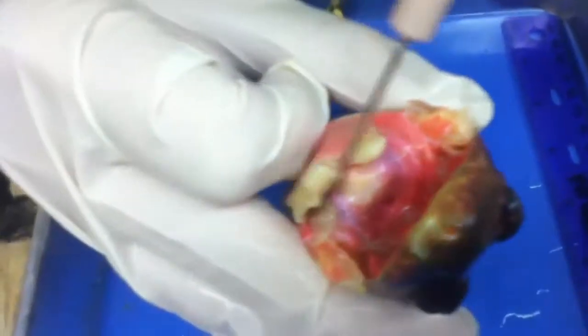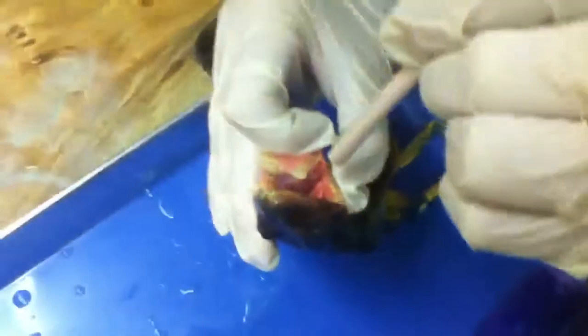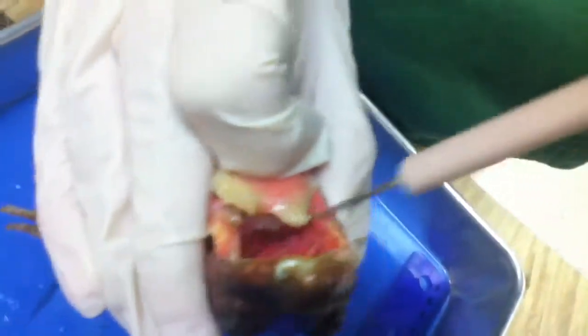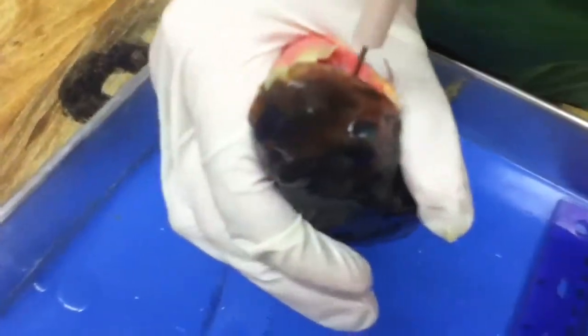Glottis. It looks like it's the back center. Do you see it? Is there something back there? There's a hole. Oh, you see it? The hole? I think that's what it is. Esophagus. His esophagus is right here that I'm opening. Around the hole. I can't see it. I don't want frog juice to squirt on me. The frog juice won't squirt on you, just look. Okay. Look right here. Oh, all around it? Yeah. Oh, okay. You can see that hole in there? Can you see the hole?